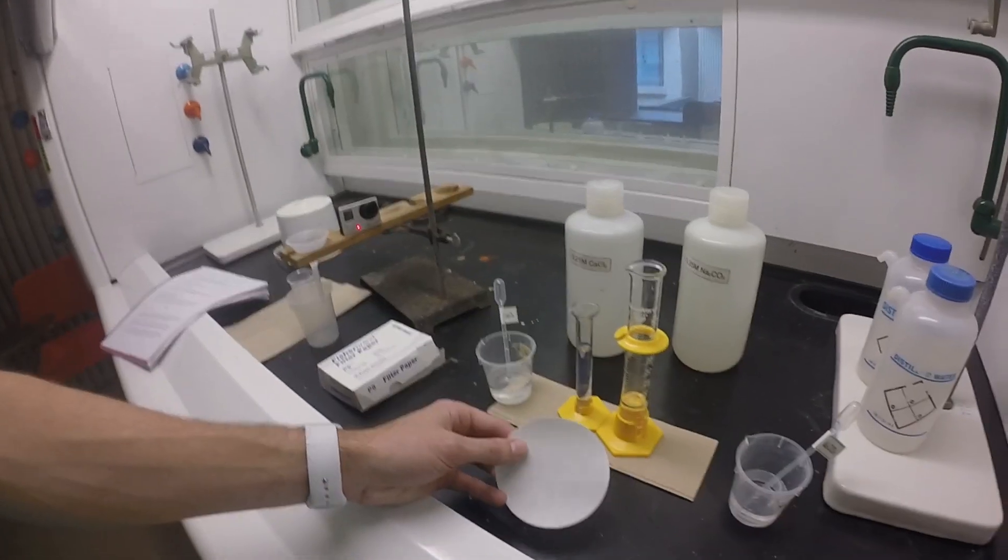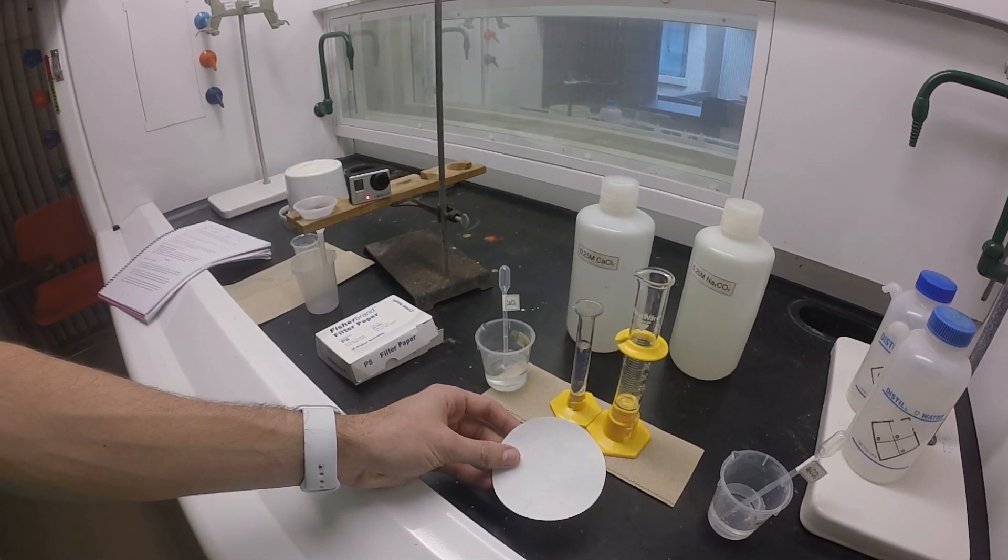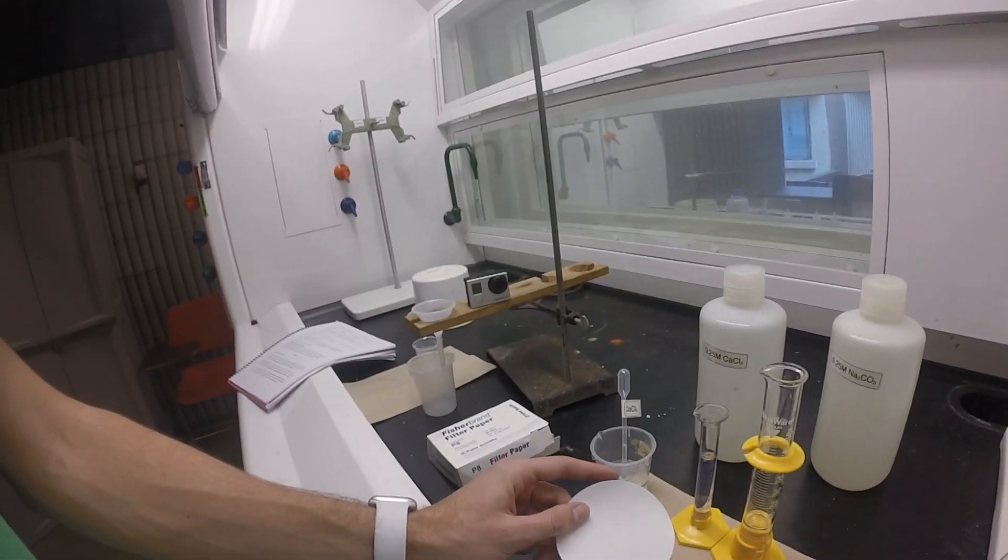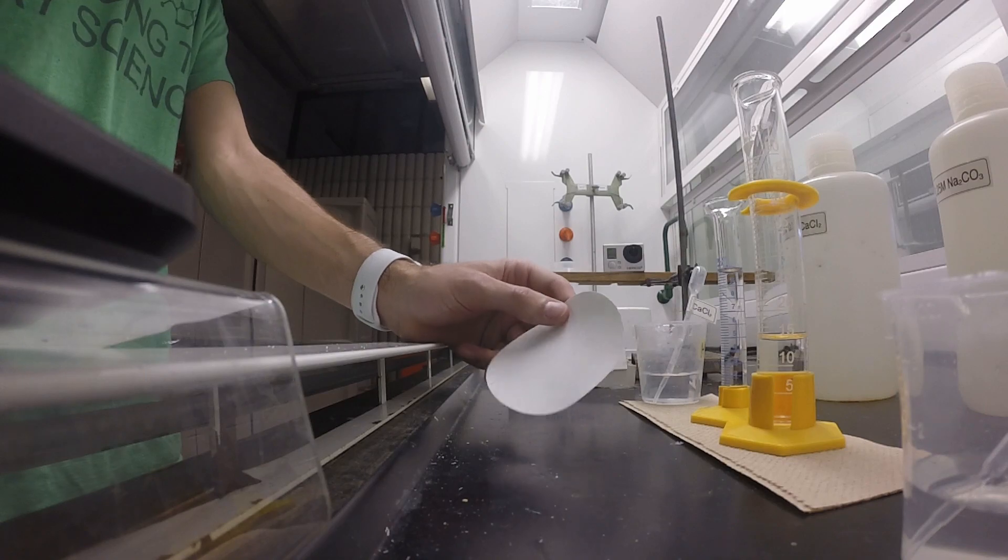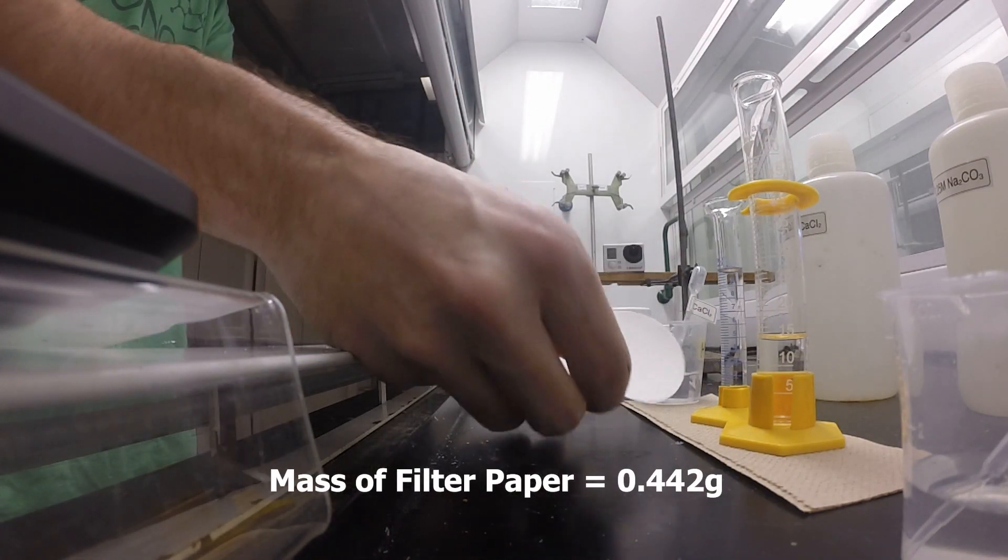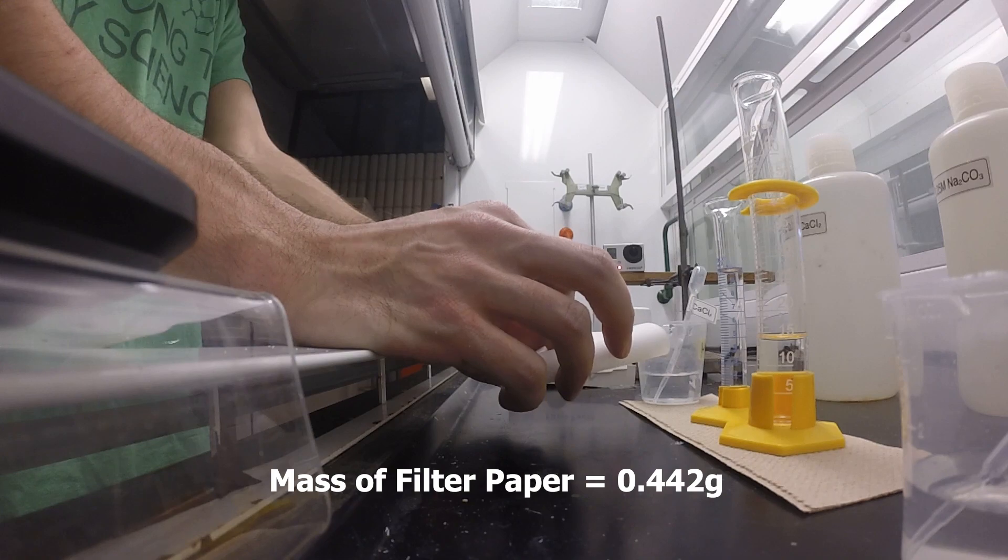Unfortunately I didn't record weighing it, but you should see in about two seconds the weight for the filter paper come up on screen. This was the dry weight - we're going to need this later to calculate how much product we have. Now I'm going to fold the filter paper so we can use it in the funnel.